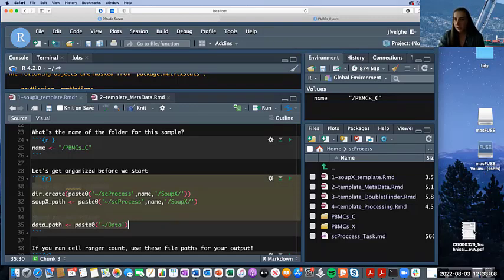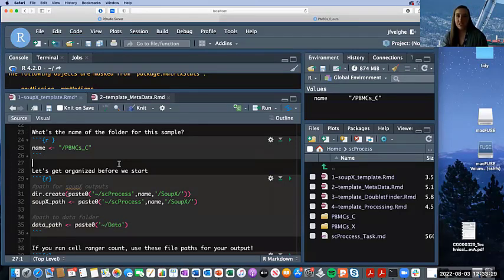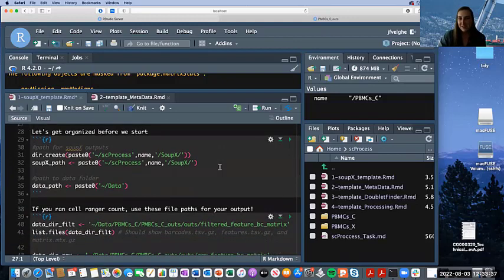Does that make sense for everyone so far? Are there any other questions, either in person or on the chat, that you have about this before we carry forward? Sorry, how do you create a new code chunk? So to create a new code chunk, I know on a Mac it is Command Option I. So for you, it might be Control Alt I, potentially. Yep, that's it. Control Alt I. Okay, so if you're not on a Mac, it's Control Alt I. For today, though, and for these scripts, all the code chunks are already written for you. So we're going to be just stepping through this to begin with.